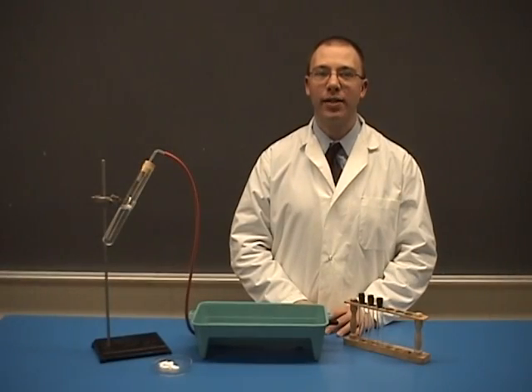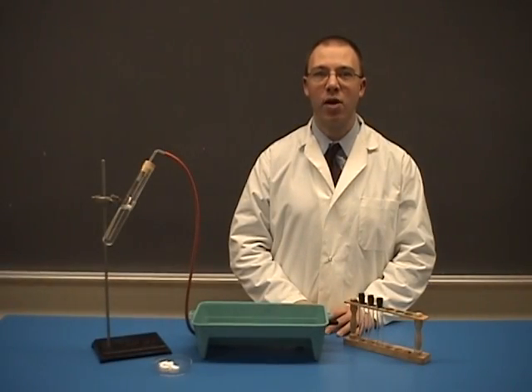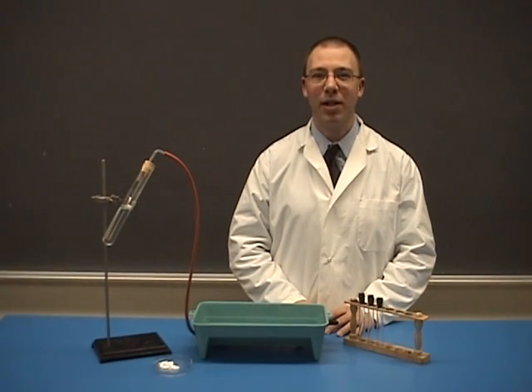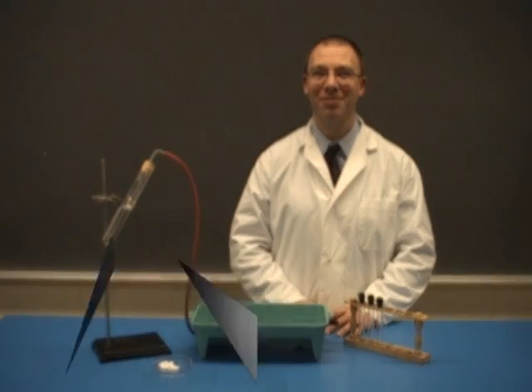In this lab, we collected an unknown gas using a technique known as the displacement of water. Hopefully, you'll now be able to collect the gas yourself using the procedures in this video.